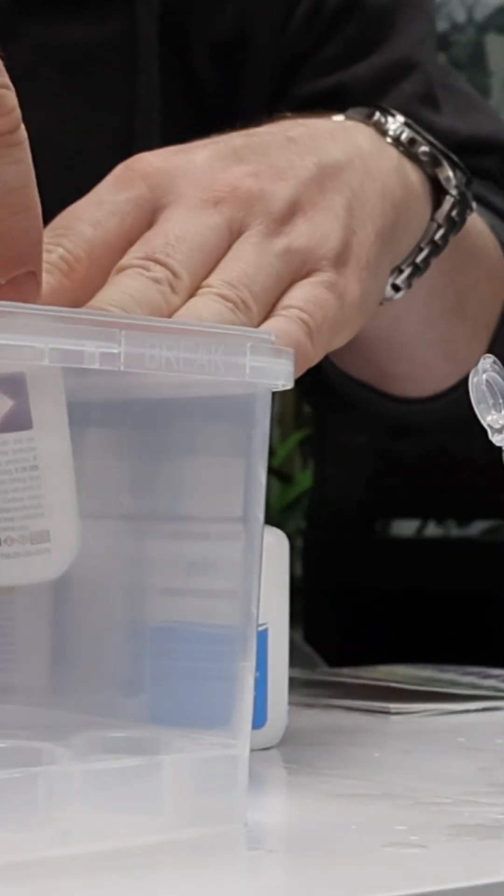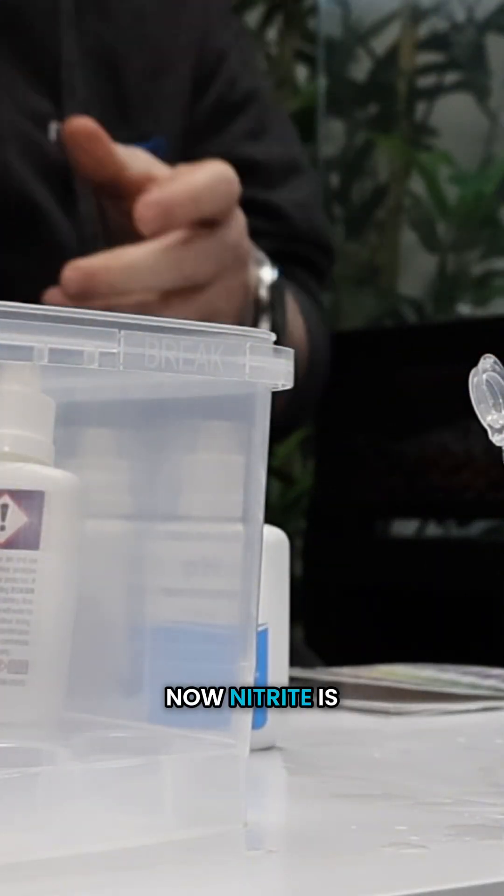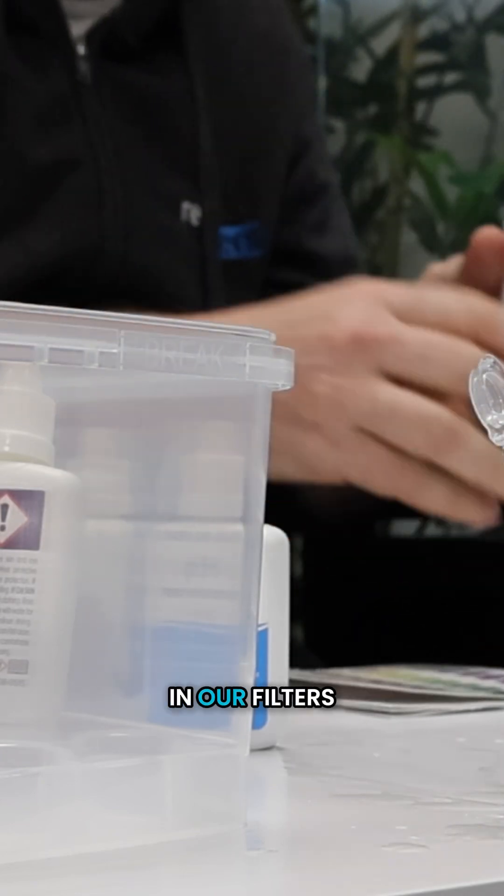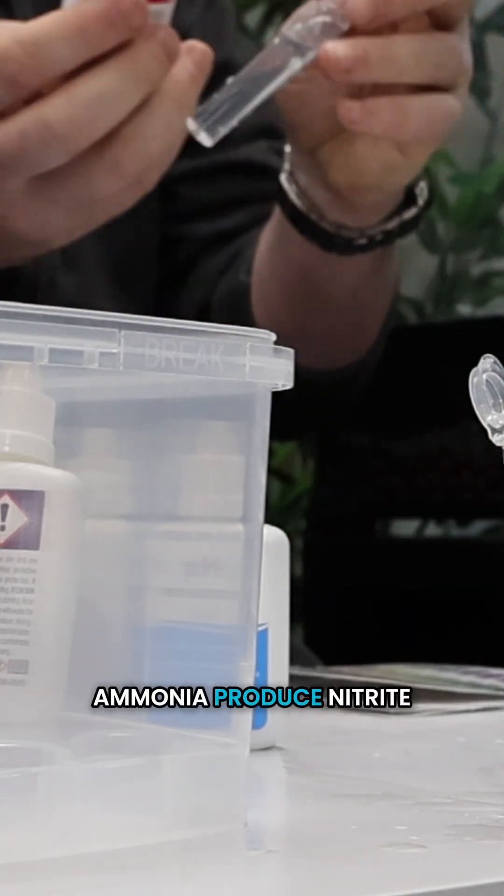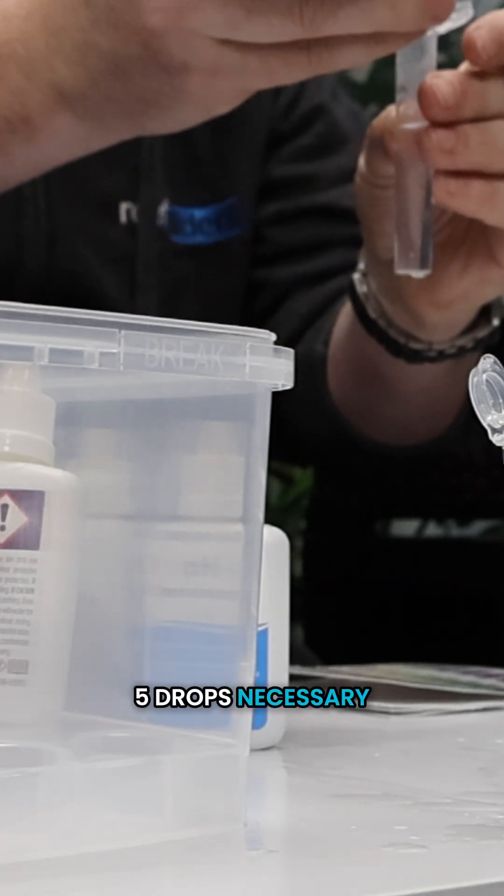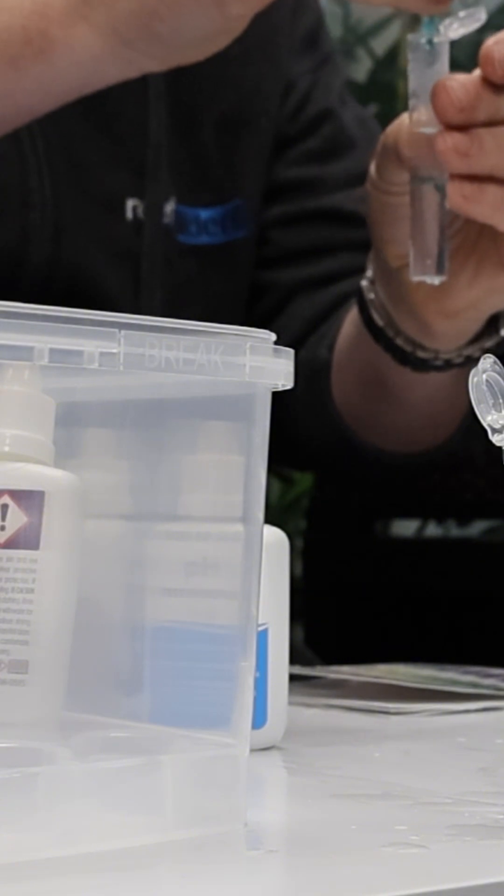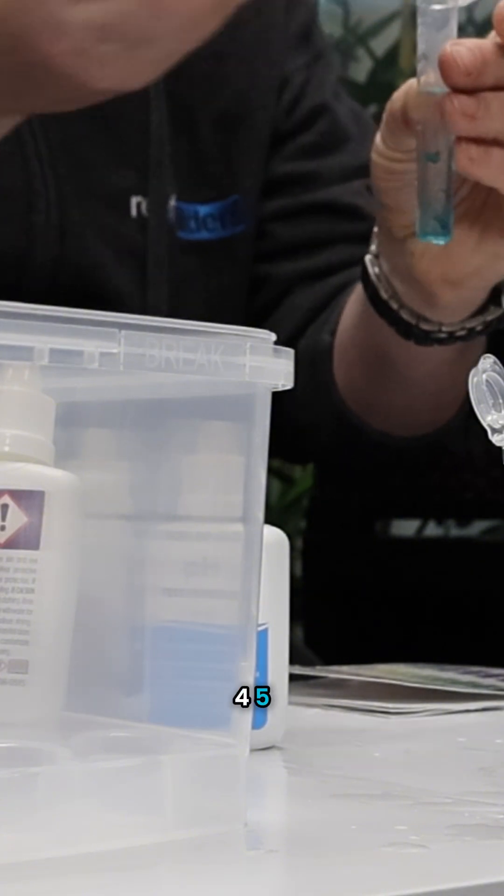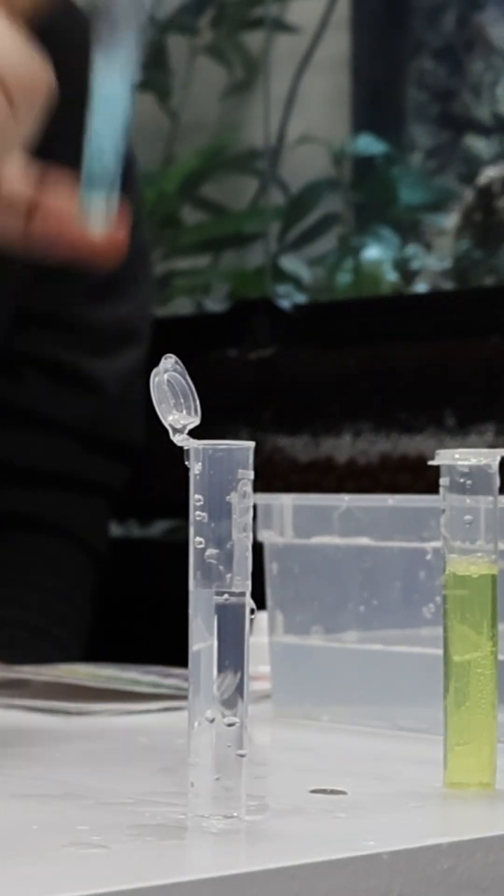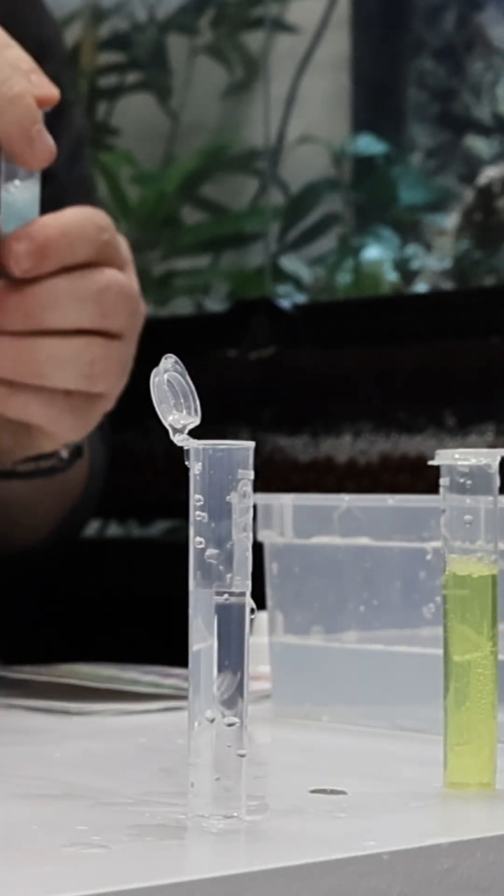Next test, nitrite. Now nitrite is a byproduct of ammonia conversion. The good bacteria that we put in our filters to break down ammonia produce nitrite, which is also bad, so let's test for that. Five drops necessary: one, two, three, four, five. Put that down, cap on, give it a shake, put that down.